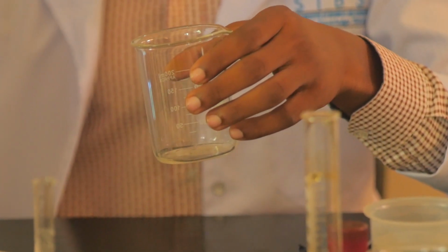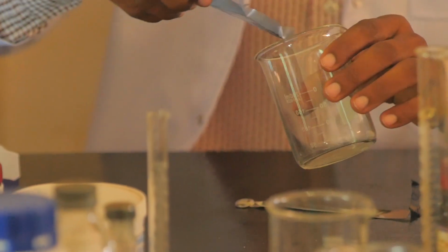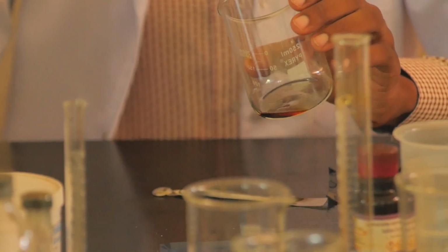This is my potassium iodide solution. Now iodine 0.5 grams is going to dissolve in this solution. So taking my iodine here, after putting it there, you also stir gently.